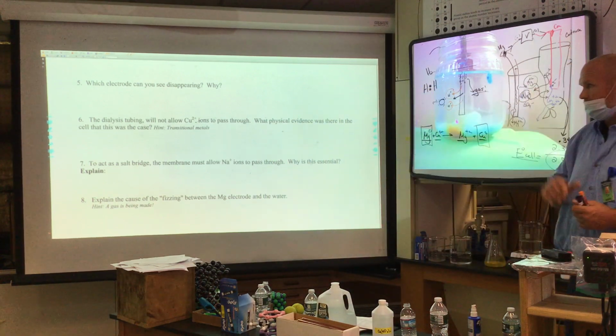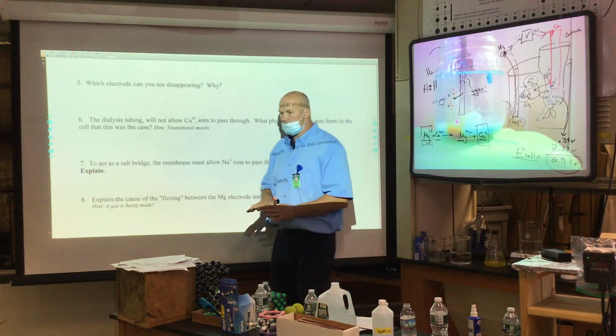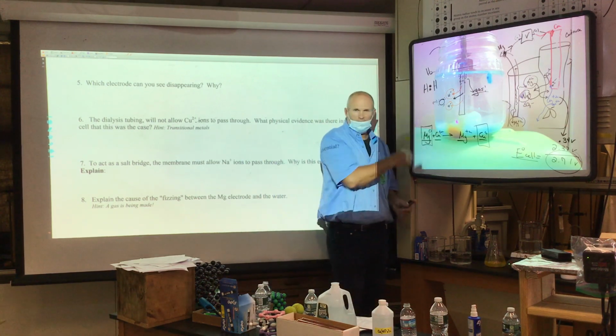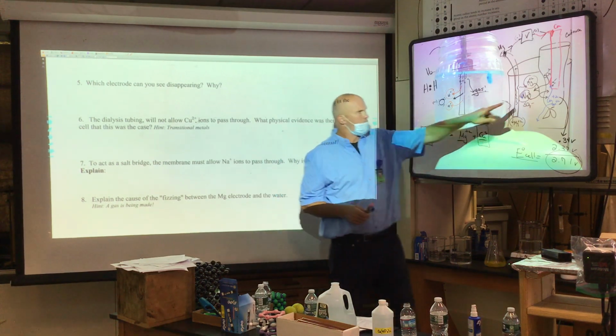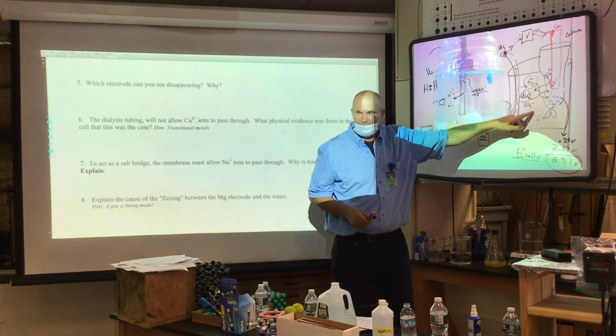You lost a volt in your lab, partly due to this side reaction with magnesium, saying, well, heck, why would I push to copper plus 2 when I can push to the water? So part of its energy to push electrons was used on the water. Remember, we might have ions in here, but the compound in greatest amount is the water.